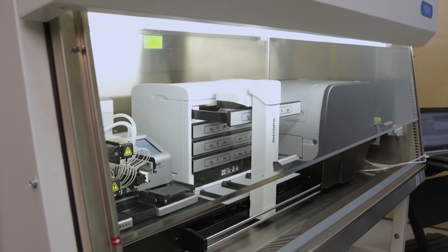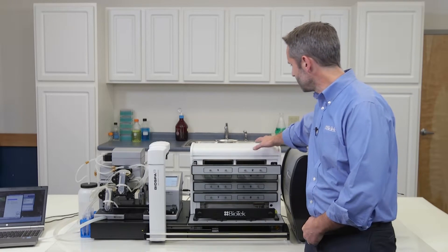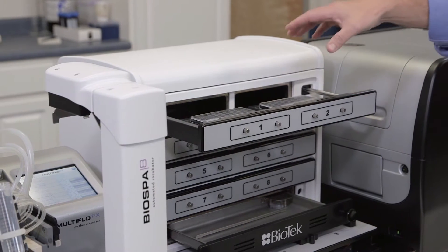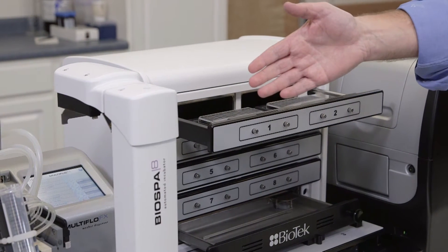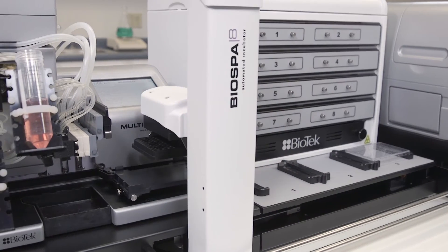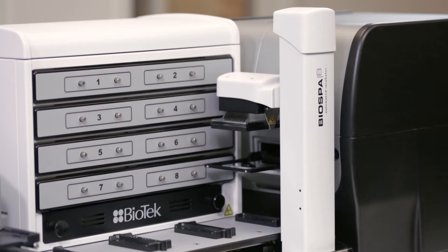BioSpa 8 is an automated incubator that fits in a biosafety cabinet. Its main components are an incubation chamber that you can see right here, four drawers on which you can load your samples, and a robotic arm that automates the sample handling process. You can see a plate washer and dispenser on the left of the system and a plate reader and imager on the right of the system.